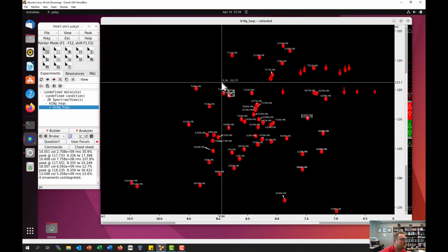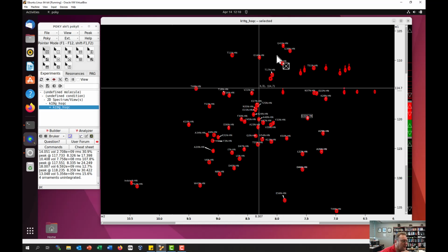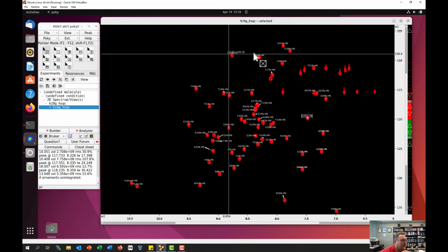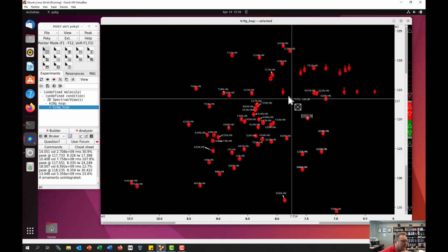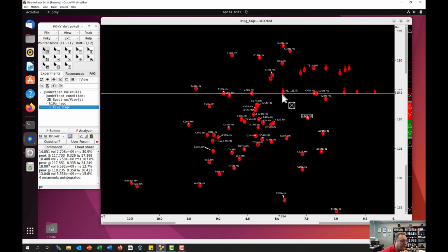Now the question becomes, what happened to our glycine 19? Right? Well, I told you that glycine was going to appear up at the top of the spectrum. And you notice that there's not really a whole lot of other peaks that are assigned here or unassigned. Right? Now looking at it, I think this is going to be your glycine peak right here. But how would I know that? What's my rationale for thinking about that? Well, I'll tell you there's two things I'm thinking about.